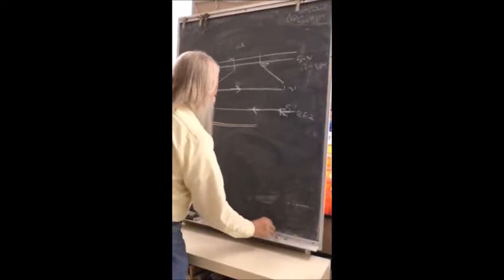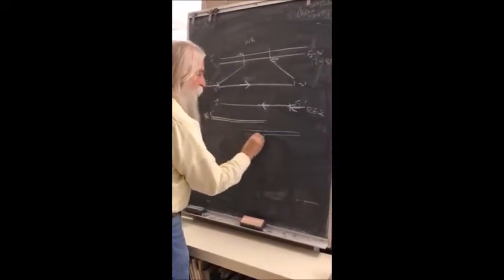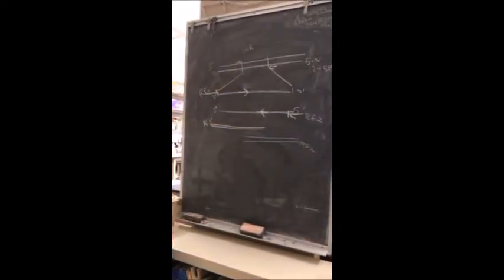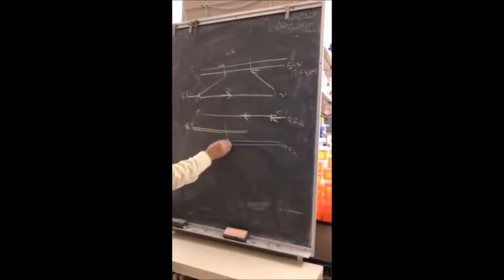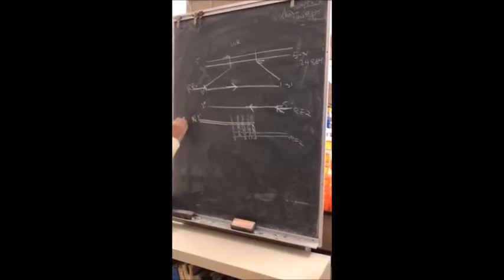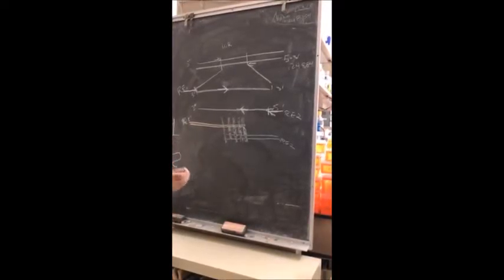And then the second step amplifies from here to here, and it generates a fragment that has the restriction enzyme site on the 5' end. Okay, so you can see that these overlap and have a region that is going to be homologous. So this is the first PCR. The second PCR is going to use these fragments themselves and no primers.